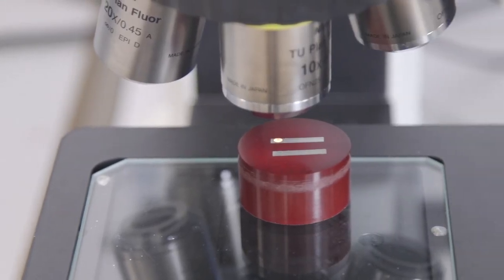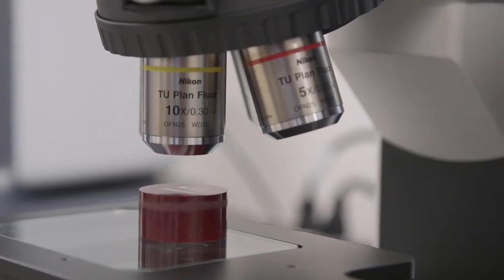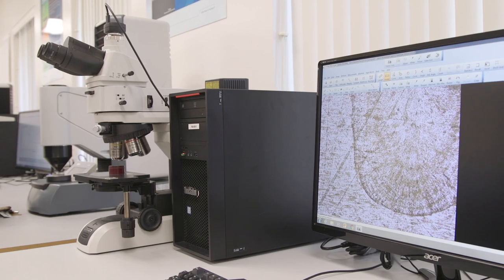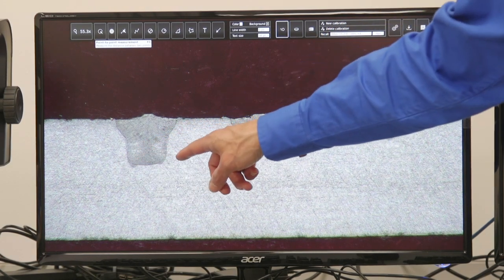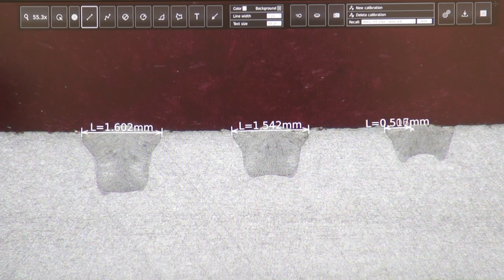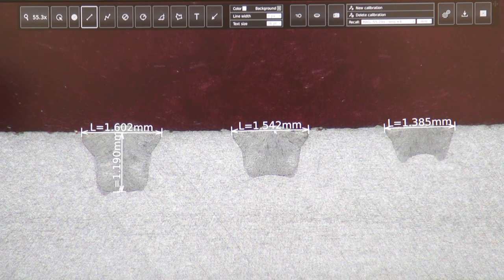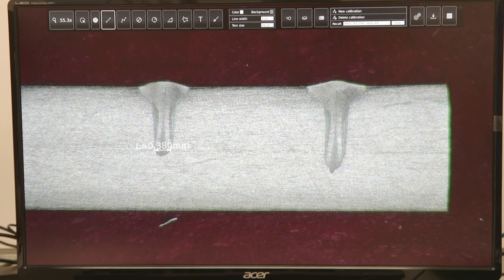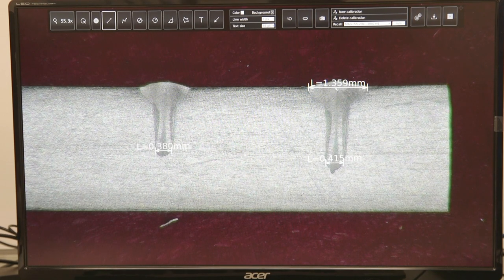In addition to weld measurements, optical microscopy is used to measure the grain size and phase area in the weld zone and heat affected zone, and to measure potential defects such as micropores in the weld zone. This is a cross section of bead-on-plate welds done by an IPG Wobblehead. Weld measurement is often required to meet the mechanical properties of the weld part — attributes such as weld depth and width at different locations. These bead-on-plate welds are done with totally different wobble parameters, and as you can see, they result in a significantly different weld profile.